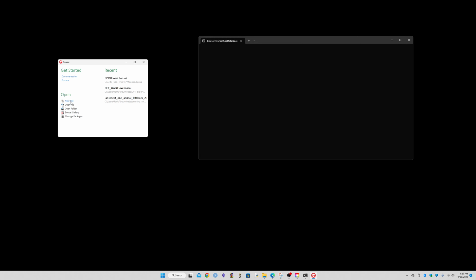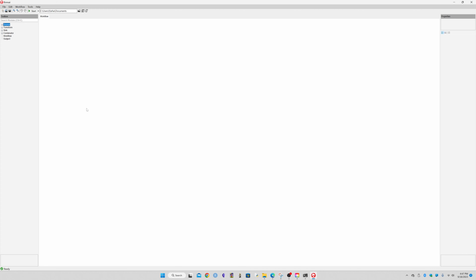So if you're new to Bonsai, you're going to obviously go ahead and open up a new file. Now there are several options. First option is that you bring in live video to be able to analyze it. The second option is you have recorded your experiments with your animals, and you want to just run your DeepLabCut analysis on top of the recorded videos. In my case, I go with the second option.